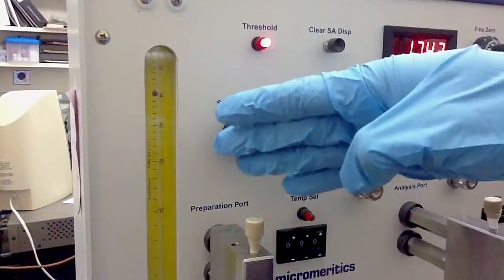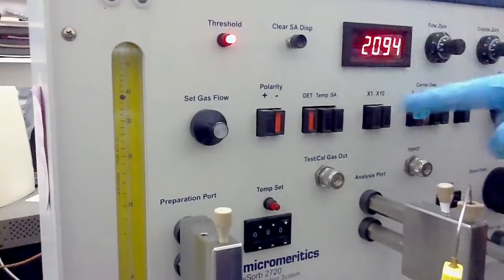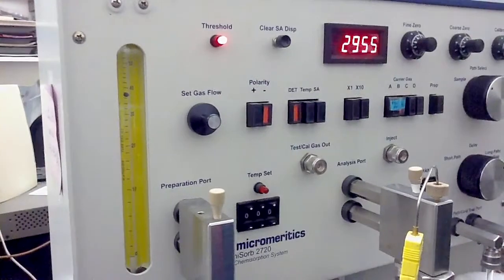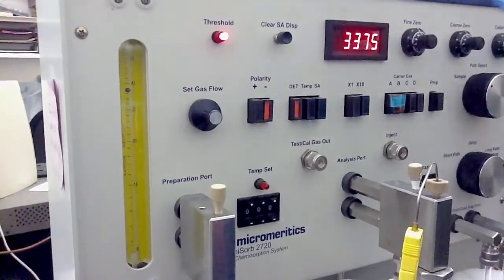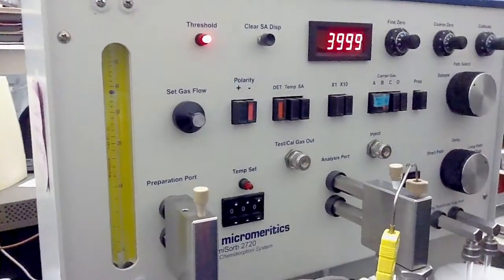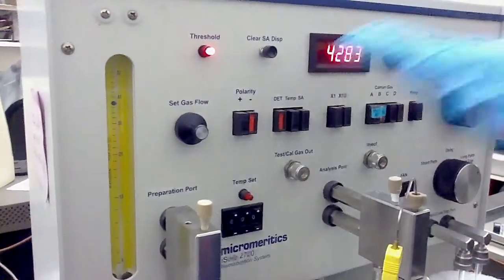Once we turn on the gas, you can see that this is going to change really fast. That means it's changing the gas inside the TCD. That's why it's giving different readings. Once it gets stabilized with only helium in there, it will become zero.